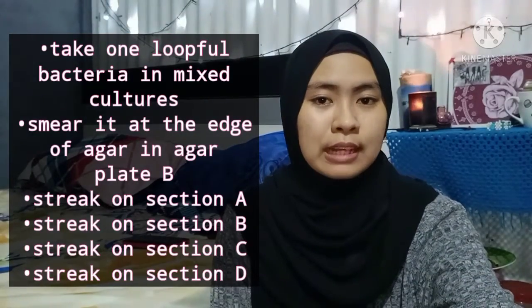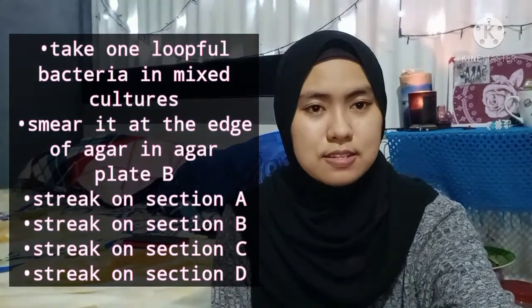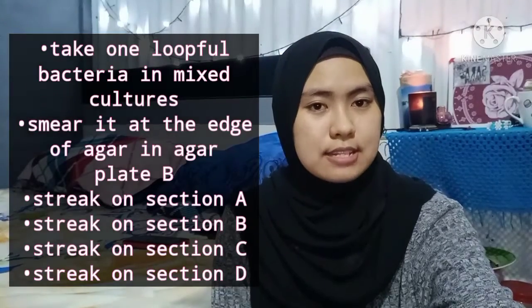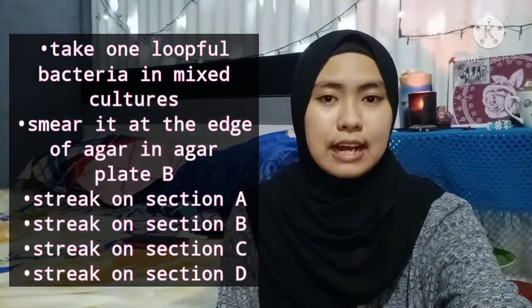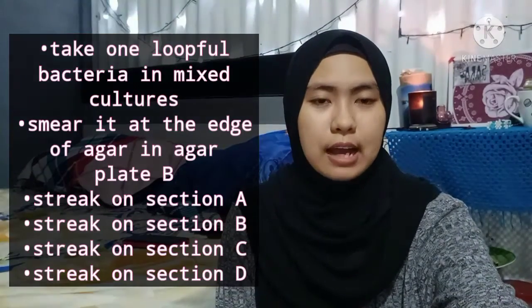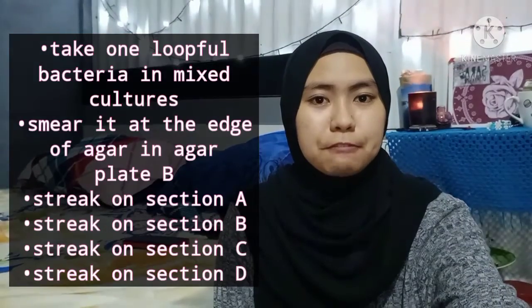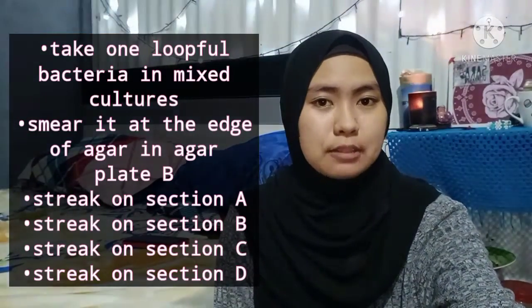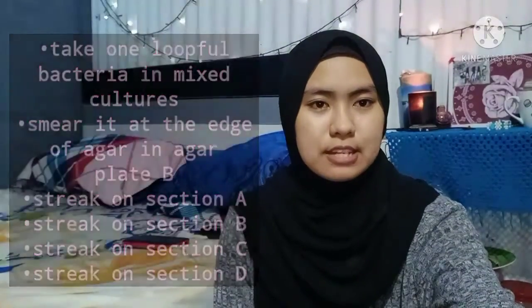Next, by using the sterilized loop, streak on the agar surface in section B. Then sterilize the loop again and streak on the surface of agar in section C. After that, sterilize the loop one more time and streak on the surface of agar in section D. Before setting down the loop, make sure to flame it again to prevent the bacteria from spreading to the environment and infecting the investigators.